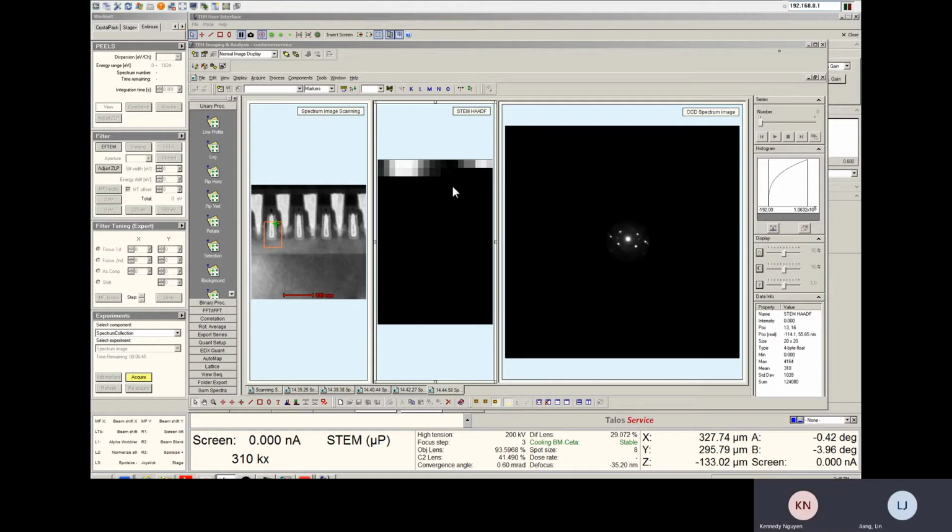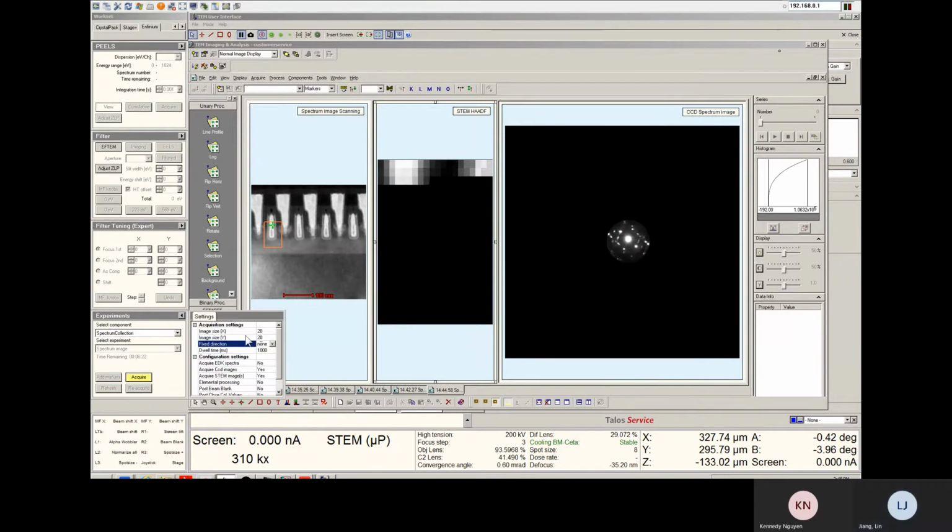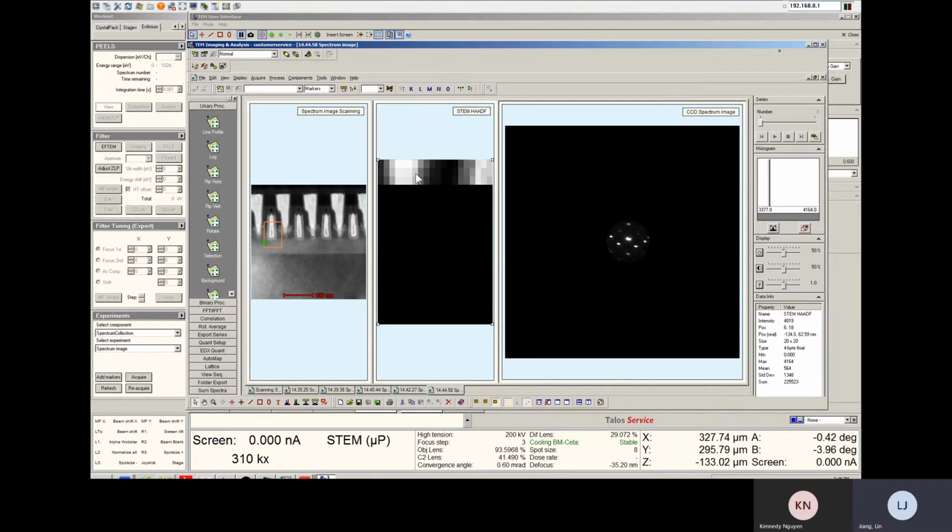Okay. So normally, let's do one volume scan, then we can stop. Definitely get a signal. If you want to get even more pixels, you can use a smaller image size, but that's gonna take a lot of time. Keep that in mind. And then I can say stop. So this is your data. You can put a bin.